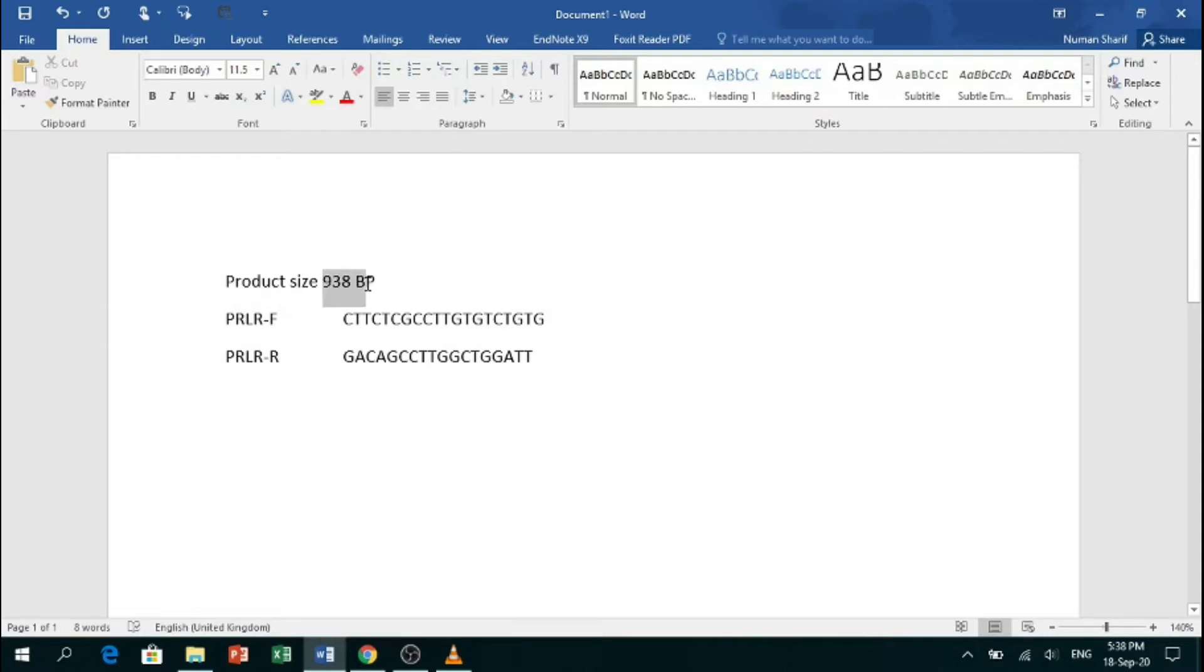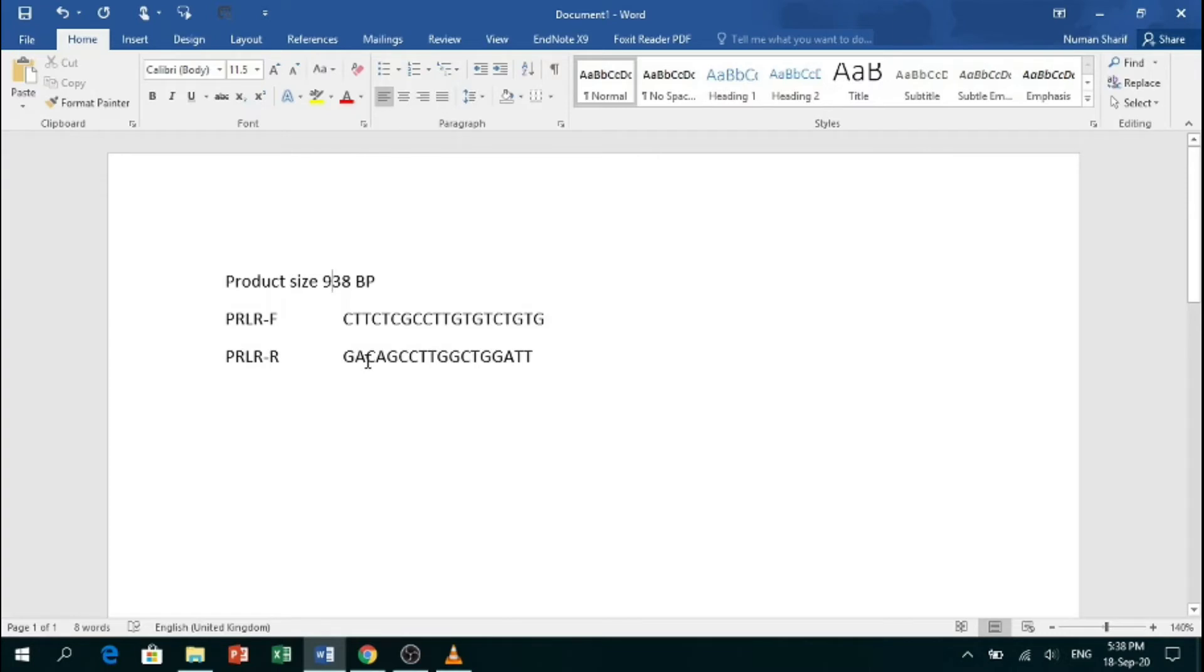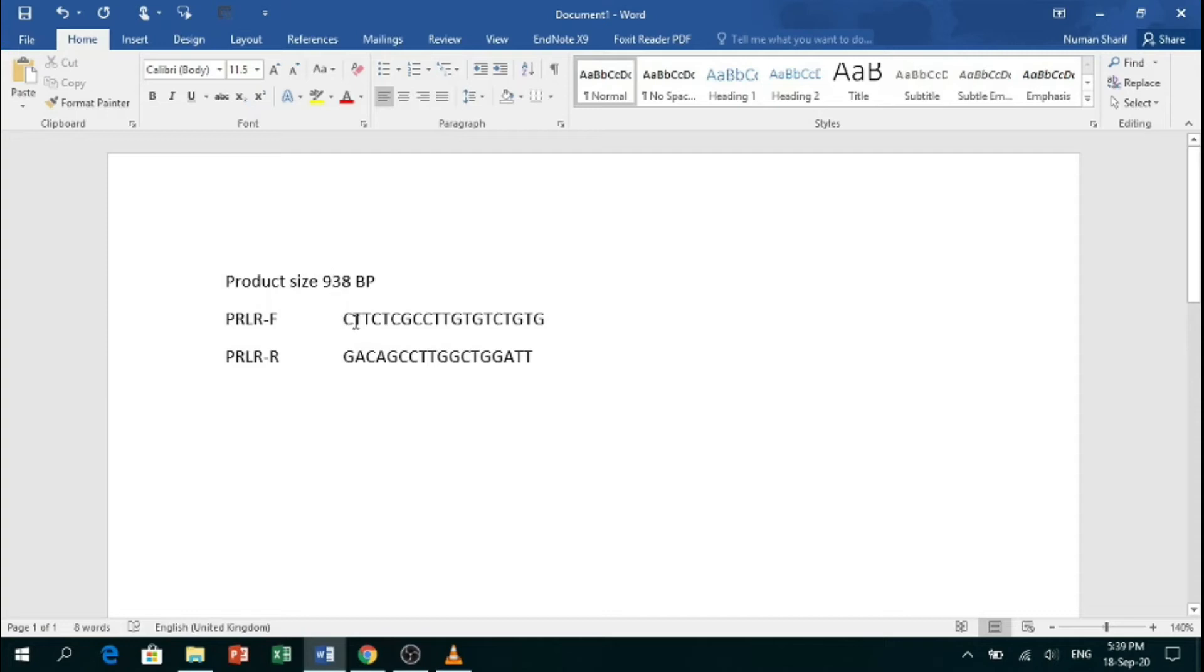There are two types of primers: first one is forward, another one is reverse. Now we will check the specificity of these primers to know if they are binding the same region for which we have designed them or not. To do so, we will use Primer-BLAST. So let's start.